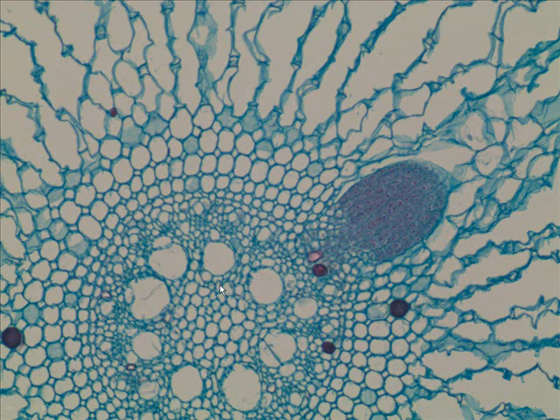And so, wow, now we see the pith more clearly. What are these big cells here, these big guys? Xylem. In between xylem, there are patches of what? Phloem. And here we have the endodermis and the pericycle. And so I believe that's the endodermis there. It's a little hard to tell.